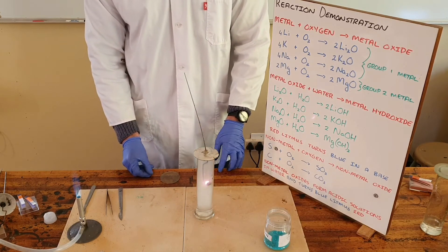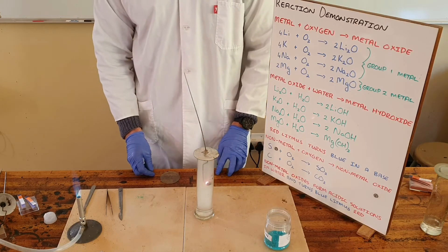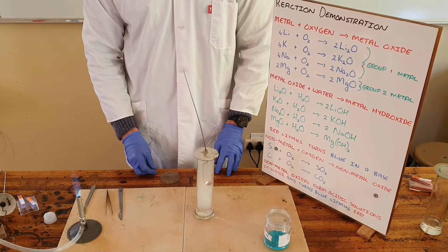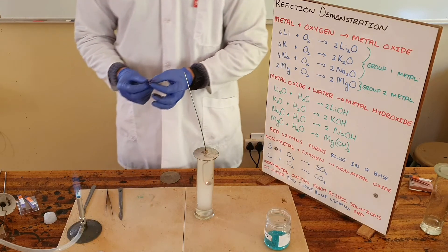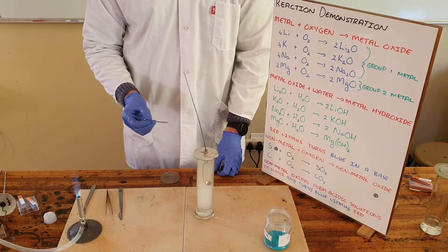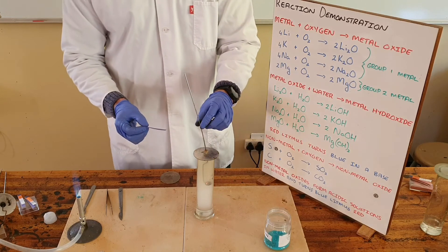We can see that there's water present in the bottom of this gas jar so we're going to allow that compound that is formed there to combine with the water, and then we are going to start by adding blue litmus into the solution. We know that if the solution is acidic the blue litmus will turn red, and then if that does not work we can add the red litmus to see if that has any effect.